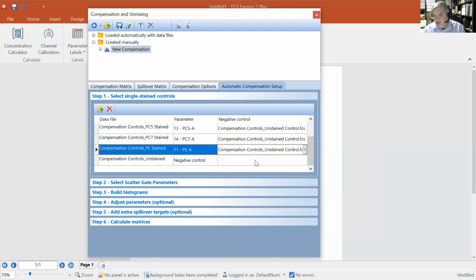All right. So there really isn't too much you have to do. As long as everything is annotated as most people do, 95% of the time, things are going to load automatically. But if you do need to force things to use an internal control, or if you have a mix of internal controls and negative, unstained controls, you can utilize that kind of mix if you want to.